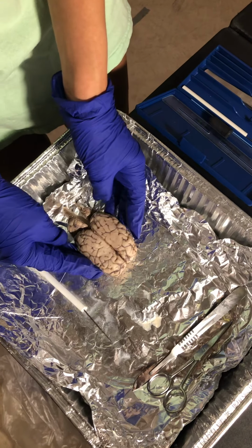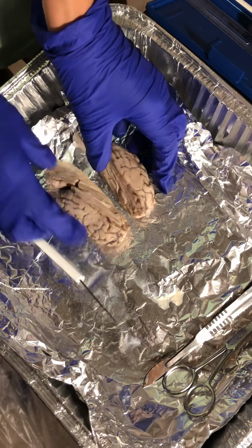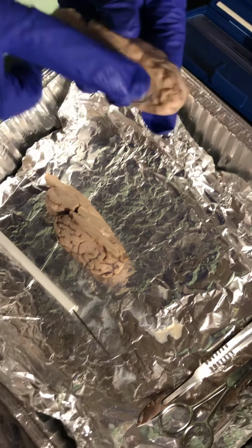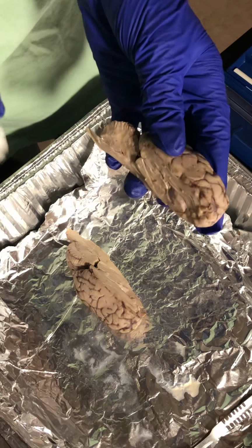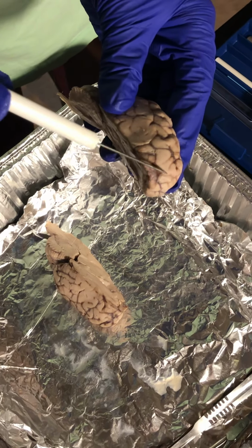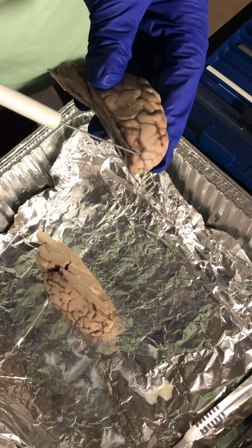So I did a mid-sagittal cut right here with the scalpel on the brain, and I'm going to focus on this half of the brain to name the structures and functions. First, I will use the probe to show you specifically. The first part is the frontal lobe, which is right here. And that is the motor functions, planning, reasoning, and judgment, and impulse control center.